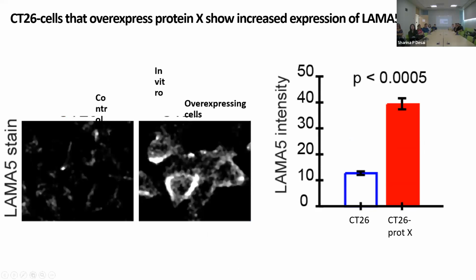So that was the one part. This is the second thing I was doing. Sharina always tells me I'm not supposed to do that here because I'm supposed to use the Cell Omics, which is much quicker. But as Jing said, you have an exploratory phase where you just want to look at cells. You do something, you stain, and you think, oh, what's going on there? I want to see it.